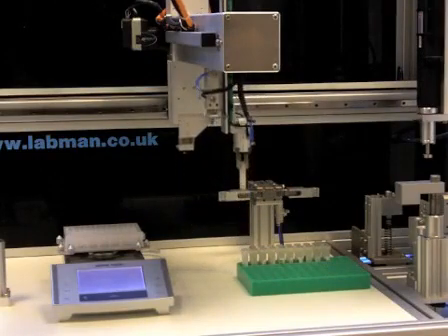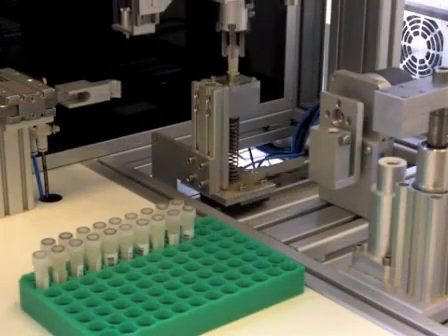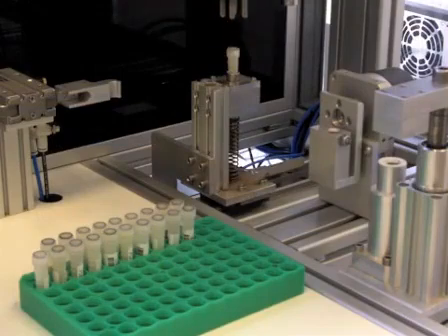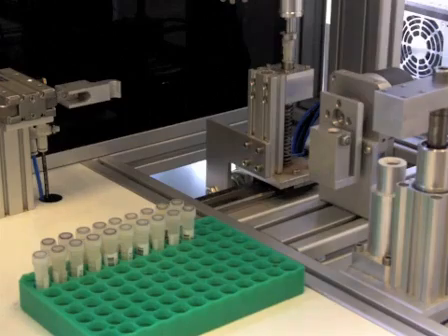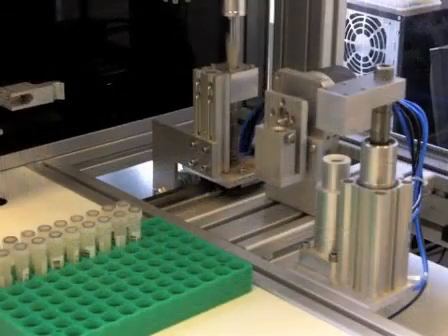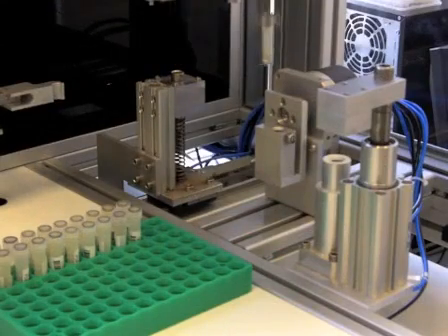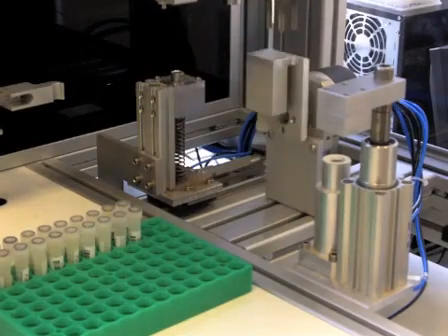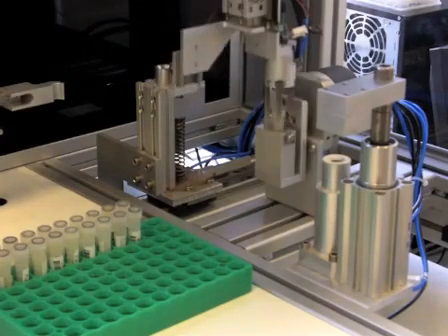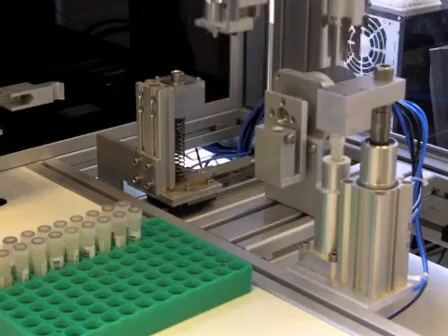In the robot, the samples are automatically ground, and mixed. To allow for the dispensing of the biomass into a 96-well plate, the vials are pierced.